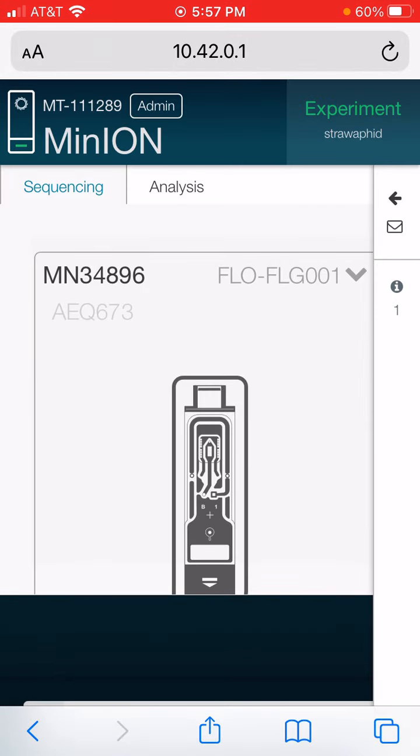Alright, we're going to start our sequencing run. It's all set up. We just need to click start run. It's thinking about it and going to warm that back up.